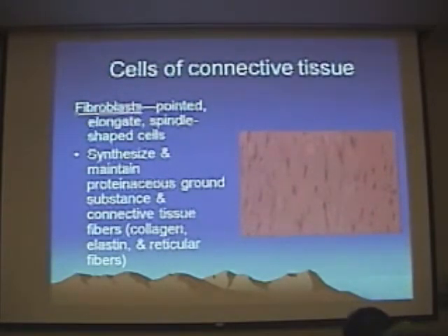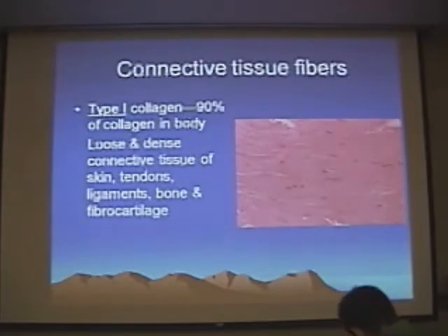And then depending on the packing and the properties of the extracellular matrix, you can often see darker pink fibers within the matrix. The most abundant of these fibers is type 1 collagen. It often packs fairly densely. And so here you can see these fibroblast nuclei, and here you can see these large collagen bundles, often forming these linear patterns. We see that in ligaments, bone, tendons.